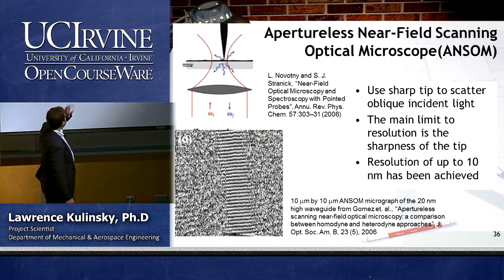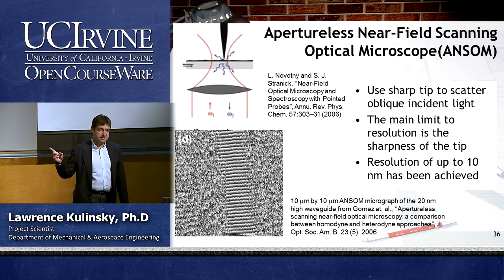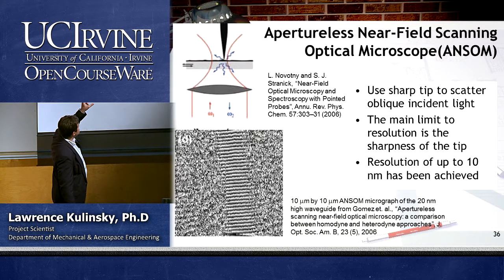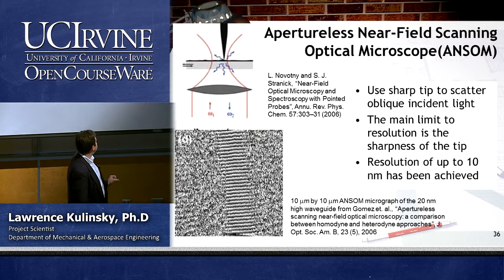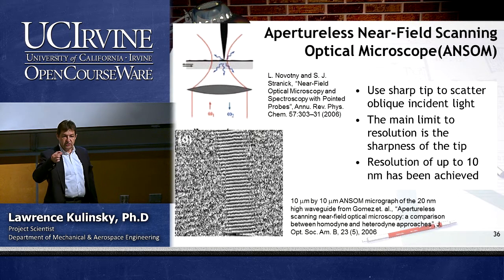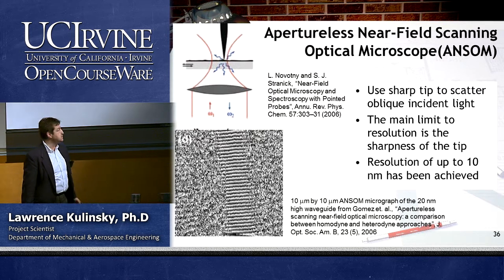So several people, among them Professor Wickramasinghe, suggested what is called the apertureless near-field scanning optical microscopy technique, where instead of having the waveguide, you have just a sharp tip, and you shine the light onto the tip, and from the tip it will be scattered onto the surface.